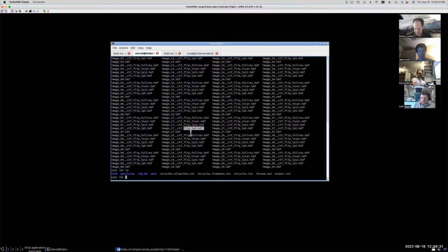So the folder I made here, rather than actually running a refinement, since I just regenerated the data, which might have taken an hour to run or something like that, I just took the existing orientations that we had from the data. So each of these particles has the orientation information embedded in its header already. And that's the information that would get overridden if you ran a refinement.